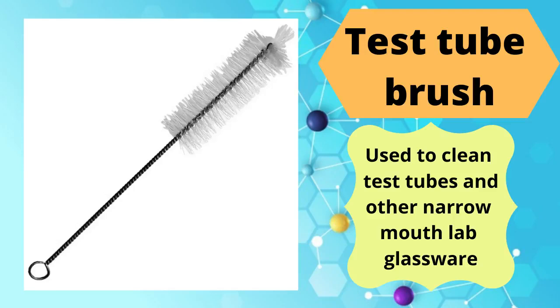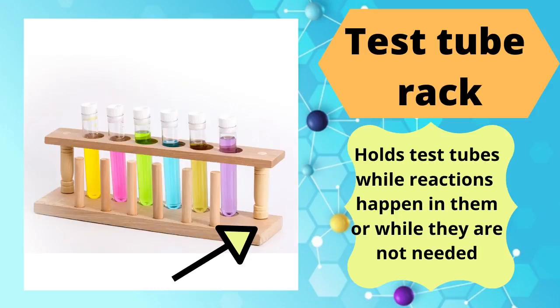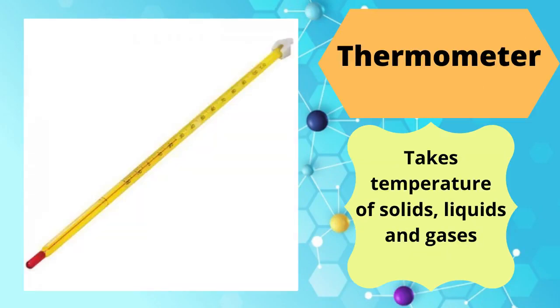Test tube brush, used to clean test tubes and other narrow-mouth lab glassware. Test tube holder, holds test tubes while heating. Test tube rack, holds test tubes while reactions happen in them or while they are not needed. Thermometer, takes temperature of solids, liquids, and gases.